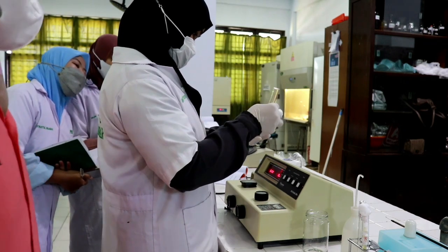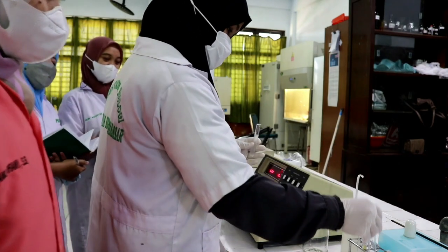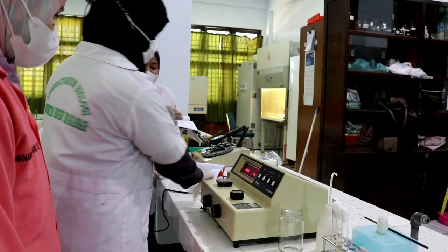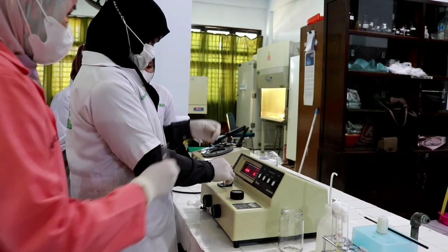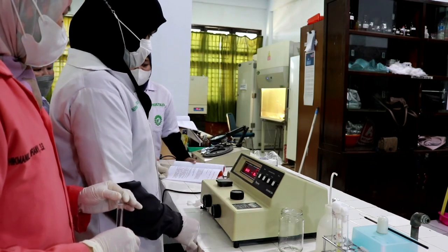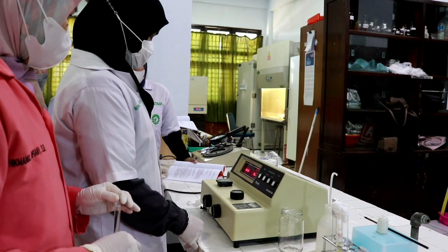In addition to the spectrophotometer, students use a cuvette, micropipette, spray bottle, hose, Bunsen, and Vortex in this activity. The spectrophotometer examines the level of turbidity or optical density as measured by absorbance value. The wavelength used in this study was 600 nanometers. Based on the preliminary test result, it was determined that this wavelength is the best for reading the density of bacterial isolates in physiological sodium chloride media.